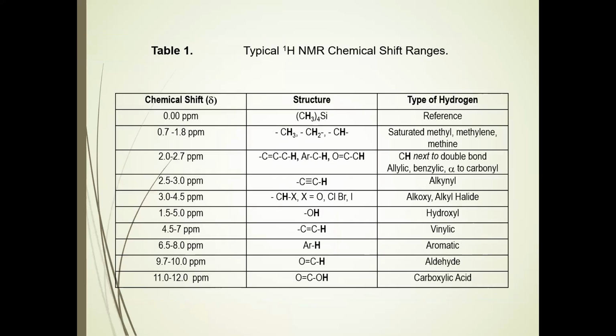We have a correlation table on this screen. This is the sort of thing that you should memorize so that you know the different chemical shifts and you can do an interpretation. You can find some that are more nuanced, but really there's a lot of overlap in trying to distinguish, say, a methyl from a methylene from a methine is really difficult to do through chemical shift. And we have integration to tell us if it's a CH2 or a CH3 or a CH1.